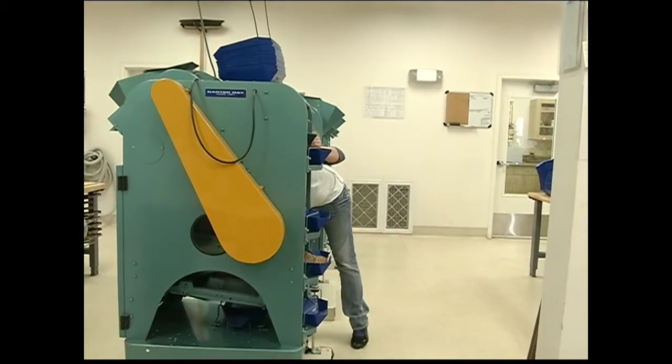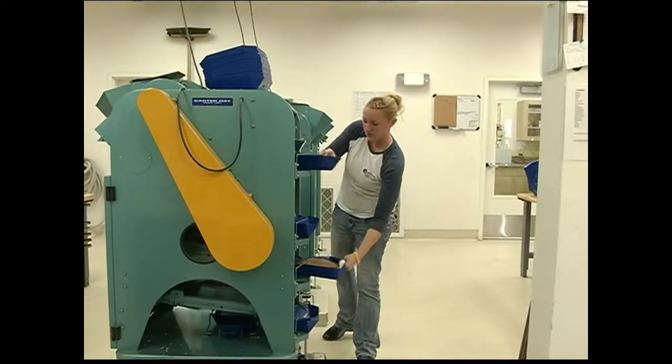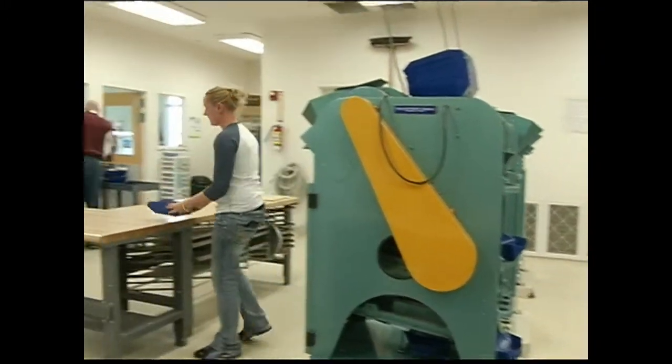As the Grain Lab provides analysis to producers, the facility itself is closely monitored. So the federal government provides us oversight, monitoring for our processes, and also comes in and actually physically will do an audit with us. They'll go through our bookkeeping, our record keeping, our grain sales, all of our equipment, all of our procedures, our inspection processes, so that they're assured that we're giving accurate results, also that we're giving unbiased results, so we're not having any undue influence from outside entities that might affect our grades.